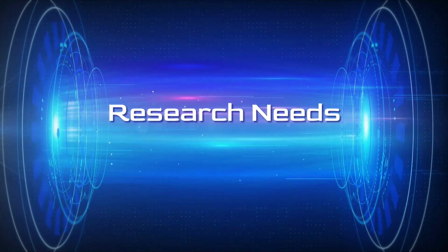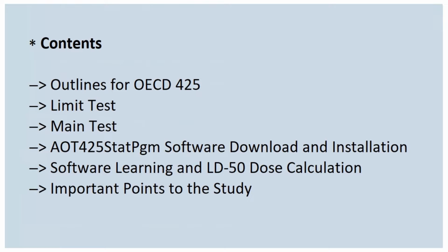Today in this video we are going to see OECD 425 guidelines, acute oral toxicity study, up and down procedure, UDP. More in this video we will see the outline of OECD 425 and limit test, main test, how to use the software, how to install it, its explanation and some important considerable points to conduct OECD 425.